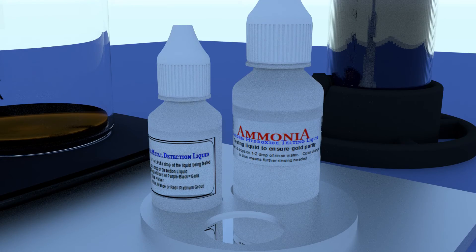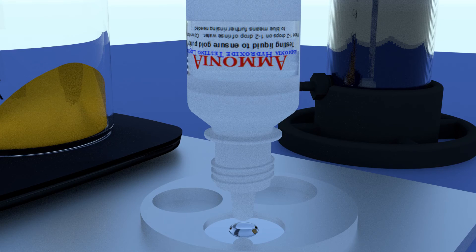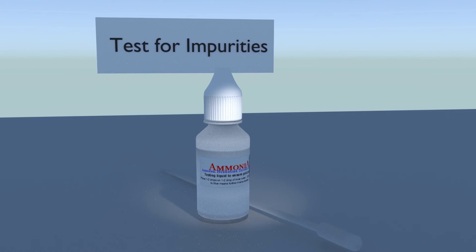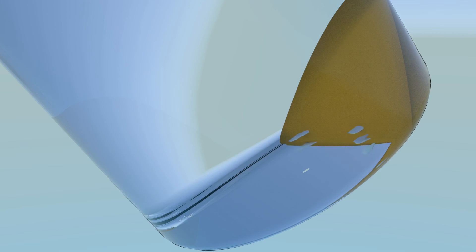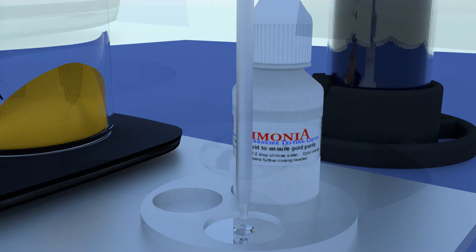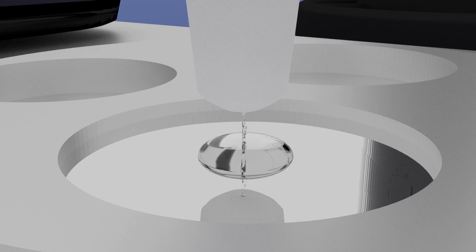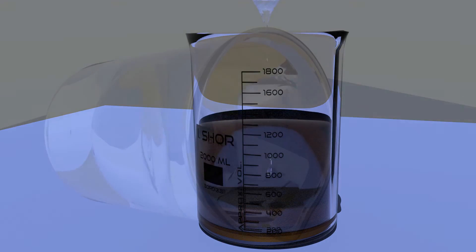The test for impurities is very similar to the test for dissolved gold. And it has a similar degree of sensitivity, 4 parts impurities per million parts of solution. This test, however, uses aqua ammonia test solution. Tilt your beaker so that the small amount of water clinging to the mud rolls down to form a small puddle in the corner of the beaker. Using the pipette, take a sample of the water and place a drop or two on the spot plate. Now add a drop or two of ammonia test liquid. Any change to blue, even the palest shade of blue, indicates impurities and another rinse is required.